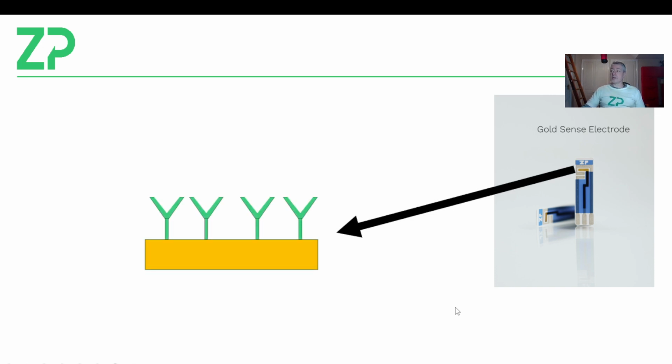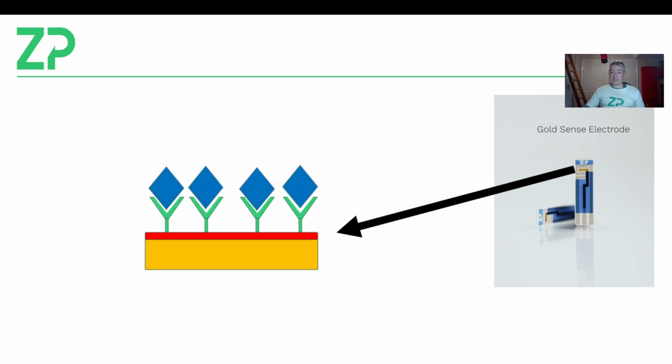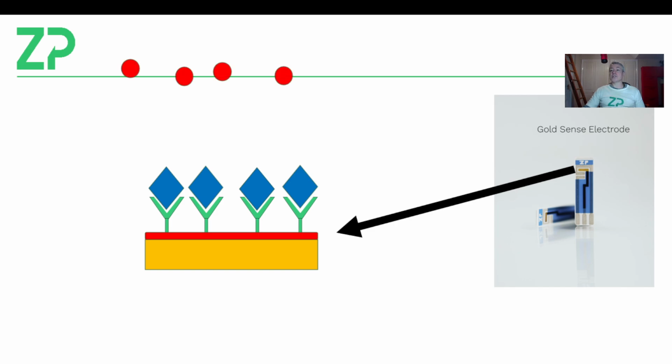But with an electrode, you put your immuno material on top of the electrode. You may put a blocking layer on there, and then you may have the binding. So first of all, you manufacture the immunosensor. So I think they've got a reproducibility problem here. Then you bring in your target. I've shown some antigens here. Now the source of their signal is, I think, that they're using possibly either ferrocyanide or ferricyanide.